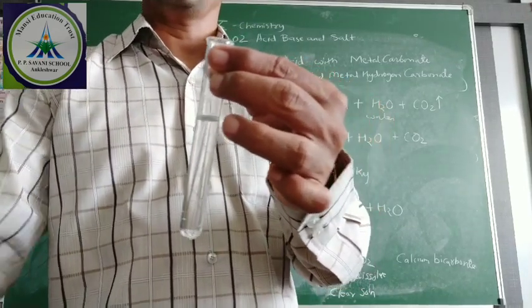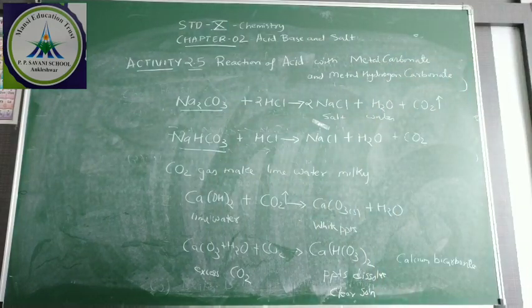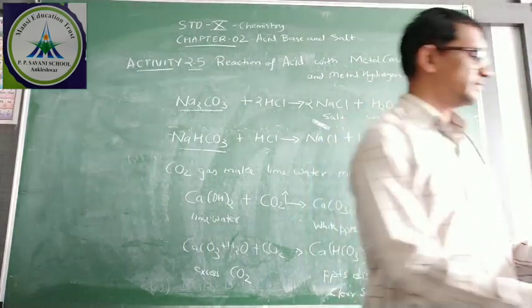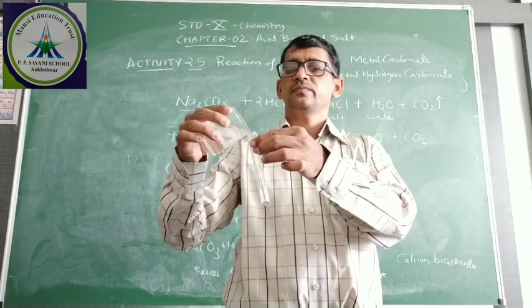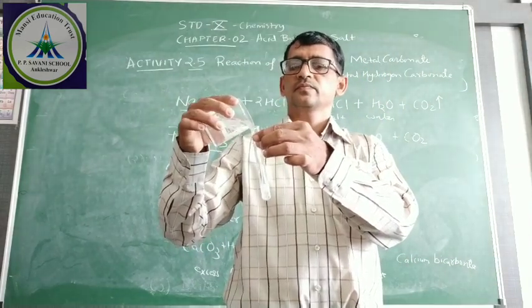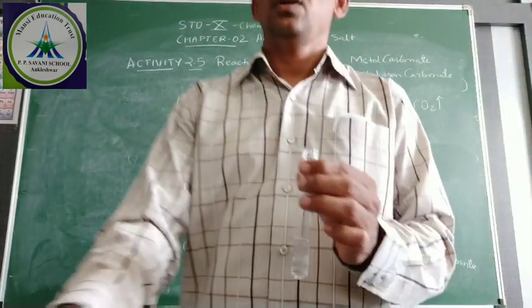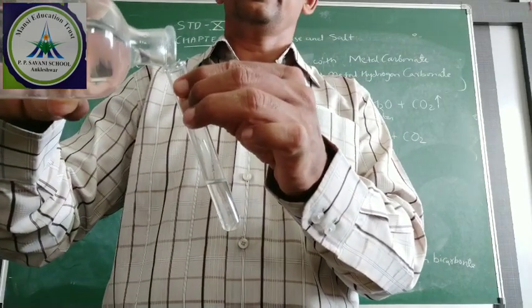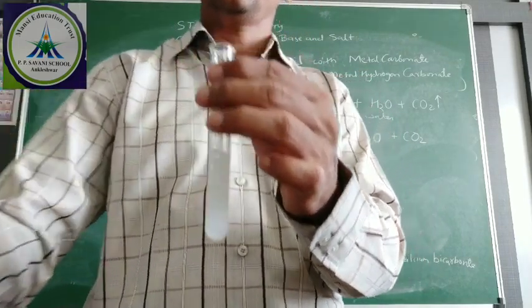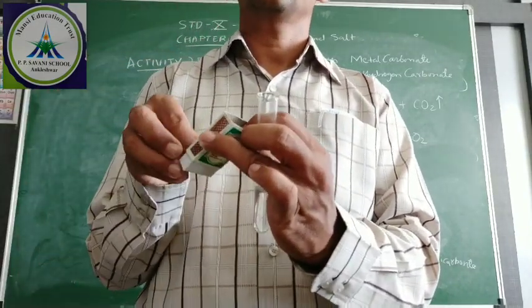Again I take a sample of calcium carbonate, plus acid, and check with the help of a matchstick.